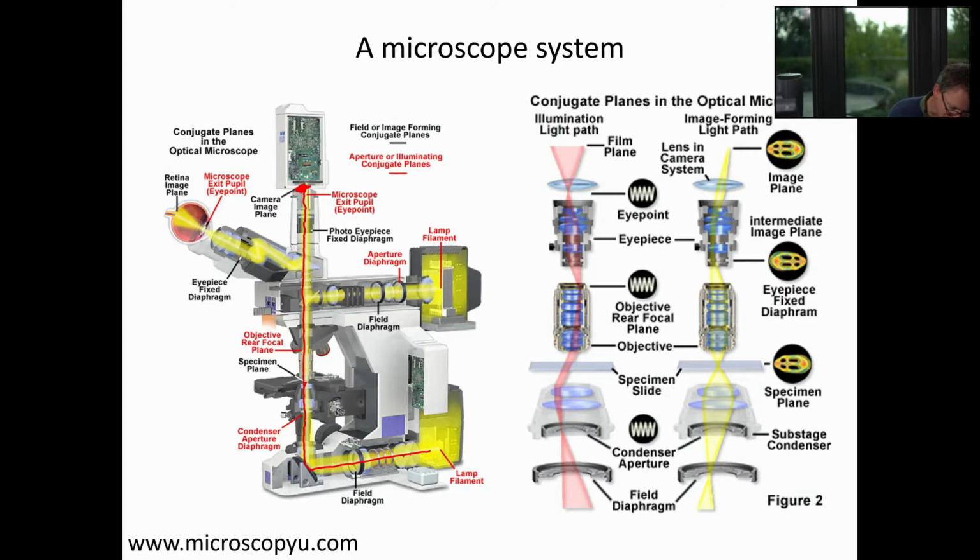And if I slide in the correct piece of optics, I can also direct the light onto an eyepiece. So there's a tube lens here, and then it goes through here and onto my eye. And you can observe the bright field image that way. So that would be bright field.